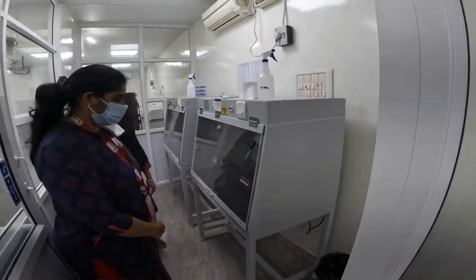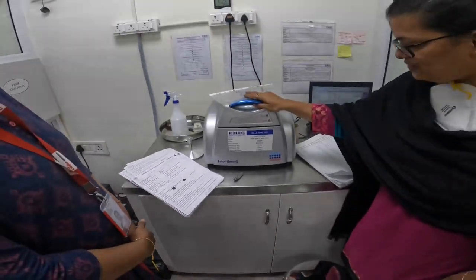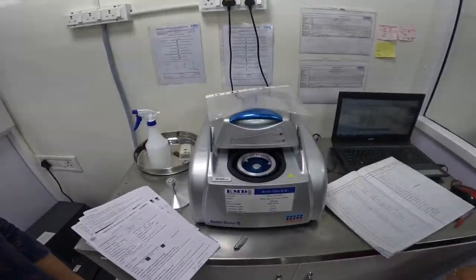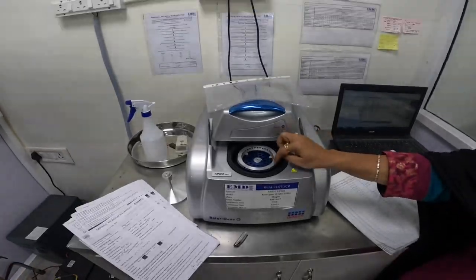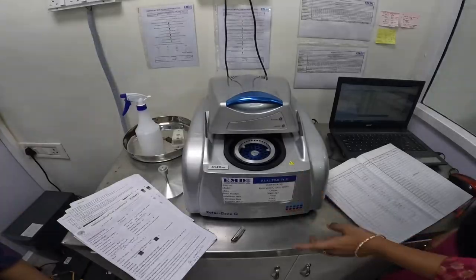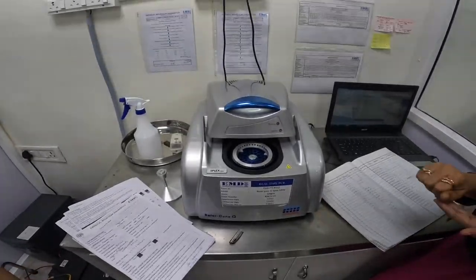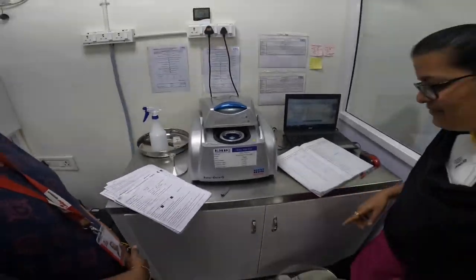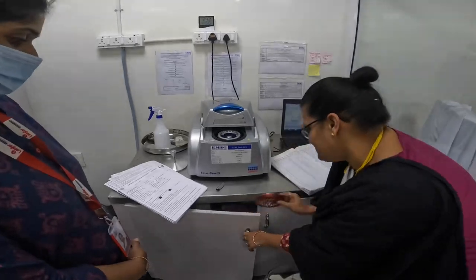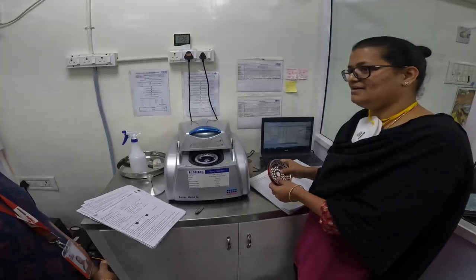Once the sample is prepared here, we go into the main PCR room where the PCR machine works. Here they have a rotary model of PCR machine. This is pretty old; now there are more advanced machines available for RT-PCR. Once the sample is loaded in this machine, the report is generated usually after 1.5 hours, and everything is through the software, where we get all the values and reports.